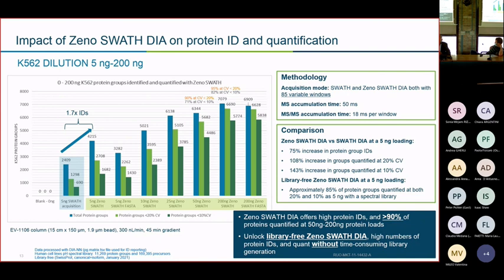And the other point that I would like to highlight is that we try to always run blanks, so that we like to see those identification rates at 0 with the blank. Otherwise, as we go down, carryover may be an issue. Perhaps another point is to highlight that both gradients and columns make a big impact at this level. Just switching the column can have a profound or a significant difference when comparing results. So keep that in mind.